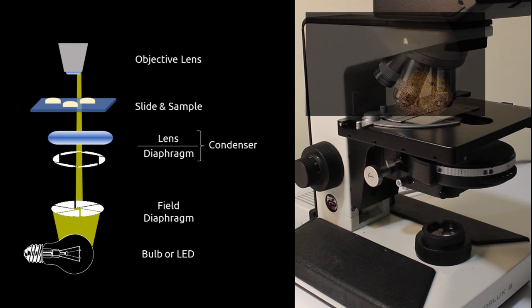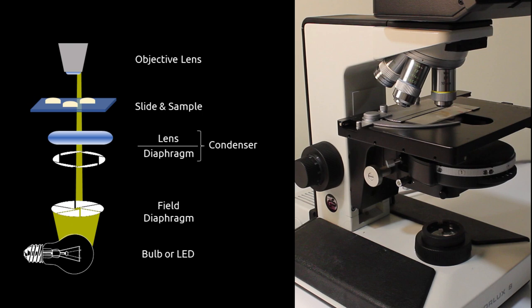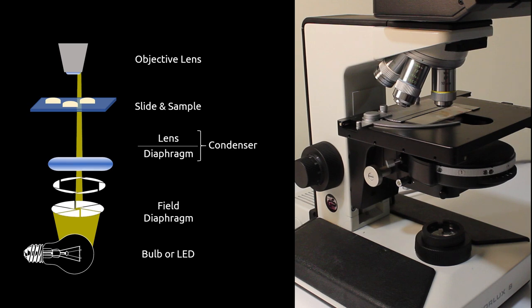The next step in the alignment process is to refine the focus of the condenser onto the field diaphragm. This ensures that we are not focused on the bulb or LED array, which can create regions of brighter and darker illumination.